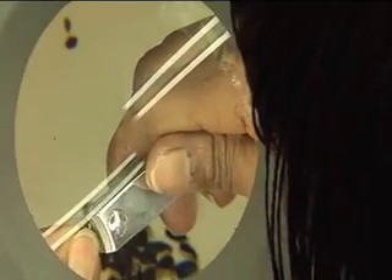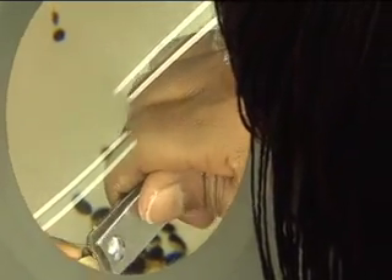When seeds are very small, you may need to use magnifier lamps or microscopes to scarify the seed coat.